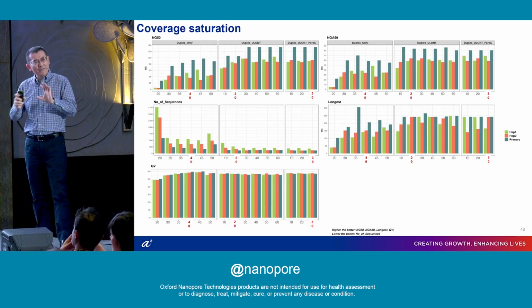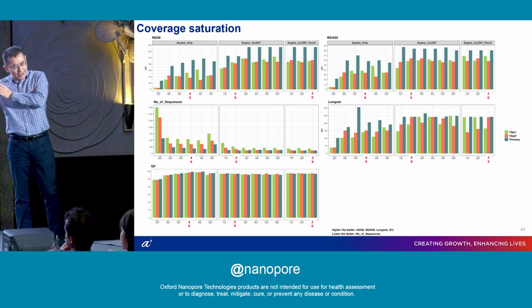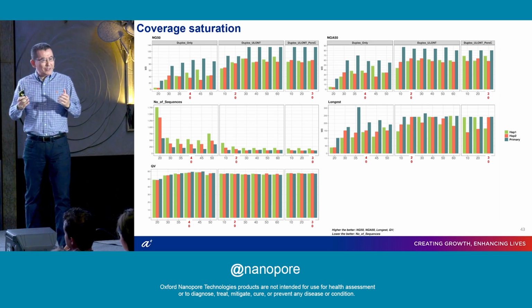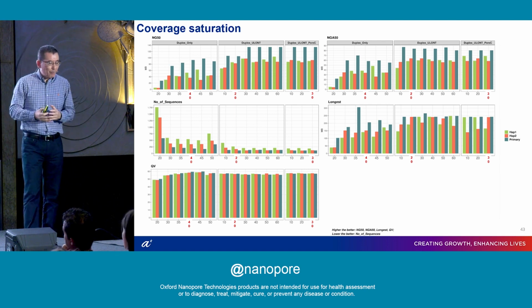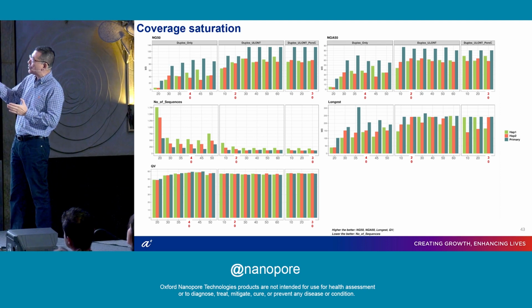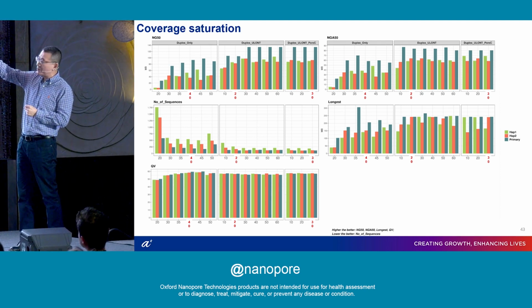So this is basically an evaluation. We evaluate 40x, 20x, and 30x. What if you increase the coverage? Would the result be dramatically improved? But actually it's not. You can see that for each of these charts, we evaluate by increasing volume of data. The red number represents the data volume we use for the current evaluation.